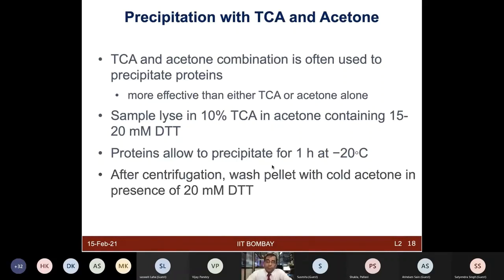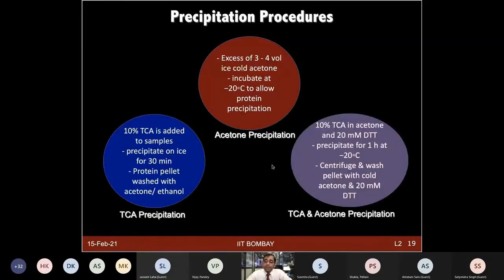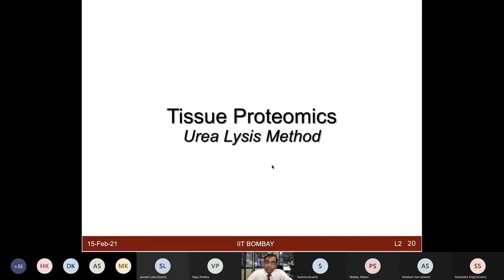And that is a very commonly used strategy for sample preparation. So just to summarize this part, if you are not sure about what type of sample prep you should be using, you should try out some of these methods yourself and see, after extracting the protein from each method, when you run them on the gel, what kind of quality of the protein you can see. When you quantify the protein, what quantity you can get from these strategies. And this is how you are going to develop a protocol. So protocol development for any sample type should be explored with a variety of methods simultaneously.